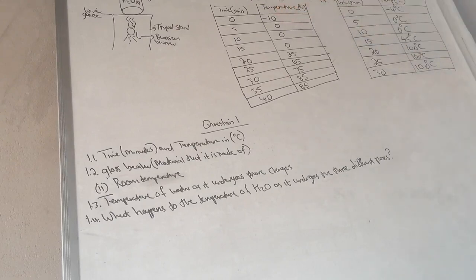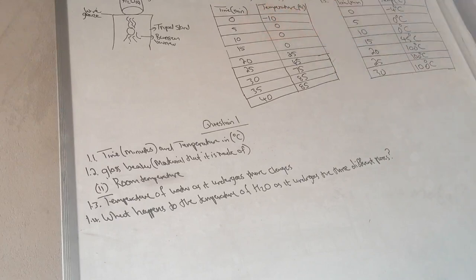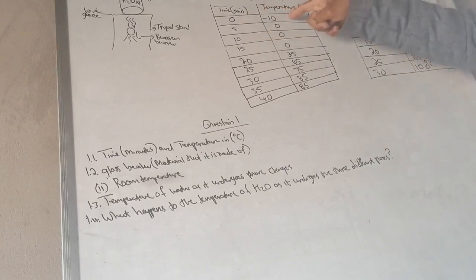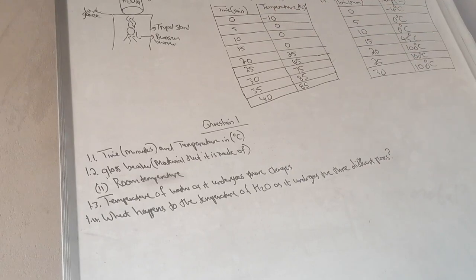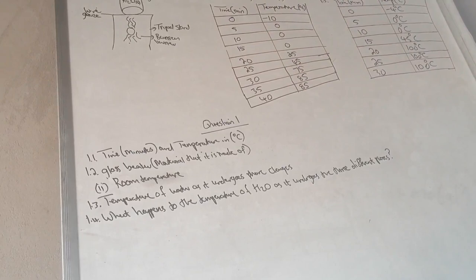You have this ice, you have taken ice out of the refrigerator and you have poured it inside of your glass beaker and it is still ice. The temperature, it's negative 10. When you press your stopwatch, this was negative, it was still freezing because everything below 0, it's freezing. Okay, and then for the first 5 minutes, it was at 0, so the temperature is increasing because we know that 0 is bigger than negative 10, so temperature is increasing. And this is true that temperature was increasing.